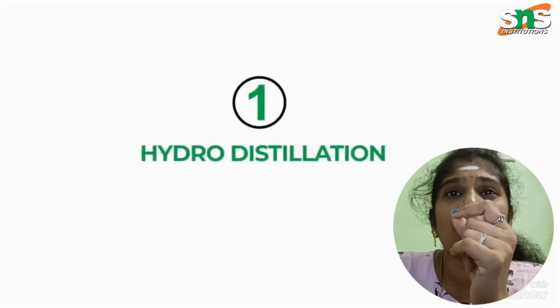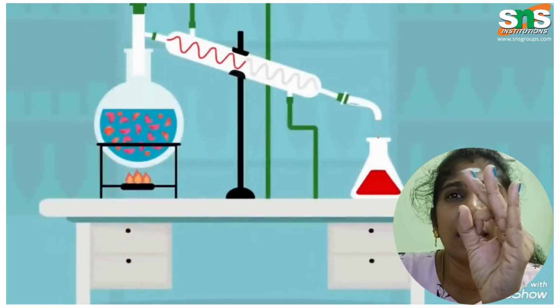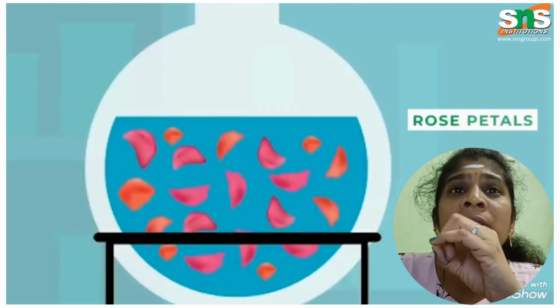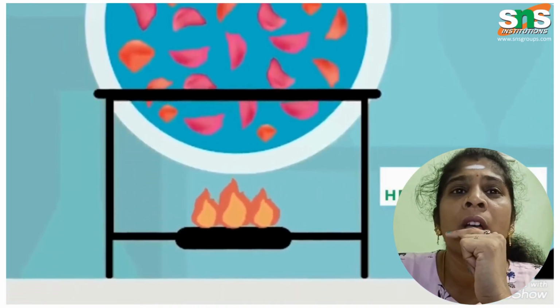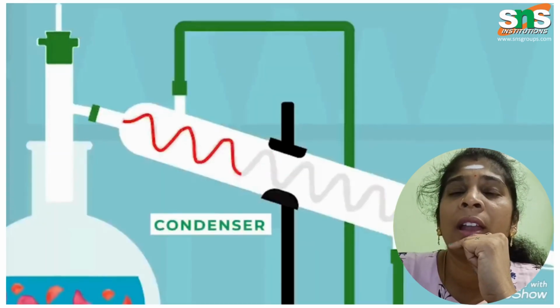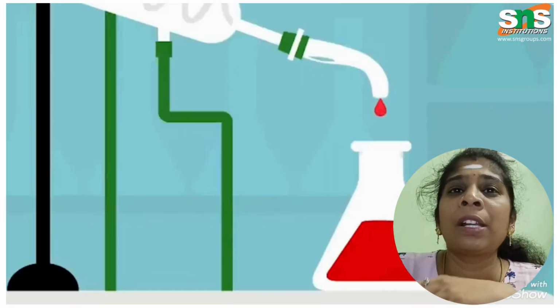Terpenoids are a group of phytochemicals derived from isoprene units, and they are responsible for the fragrance, flavor, color and therapeutic properties of many plants. Examples include menthol, citral, artemisinin, camphor, thymol and many essential oils. So now let's go deep into the extraction, isolation and analytical techniques of the citral obtained from the lemongrass oil.